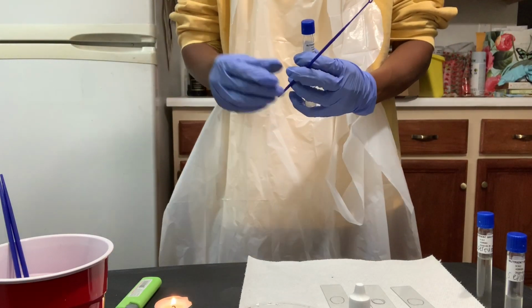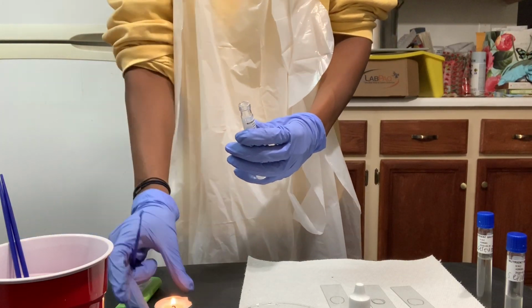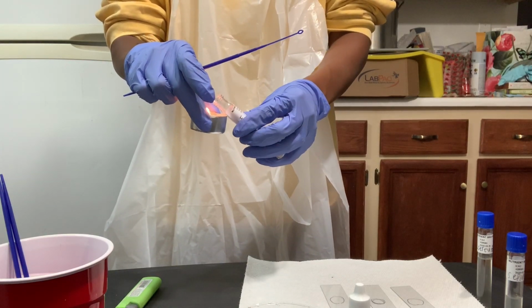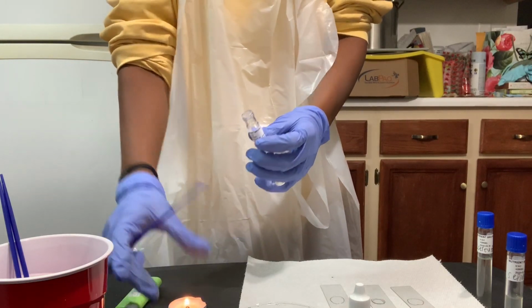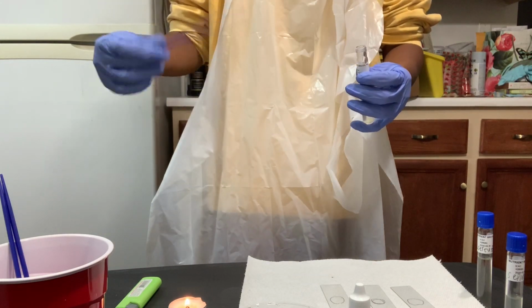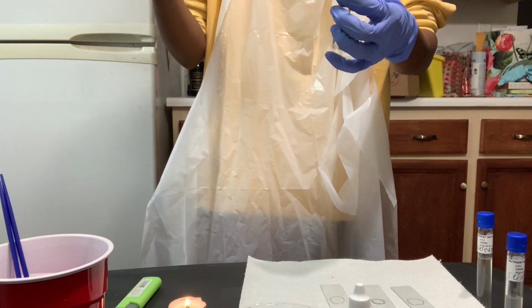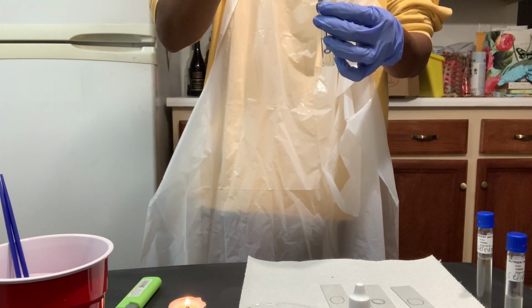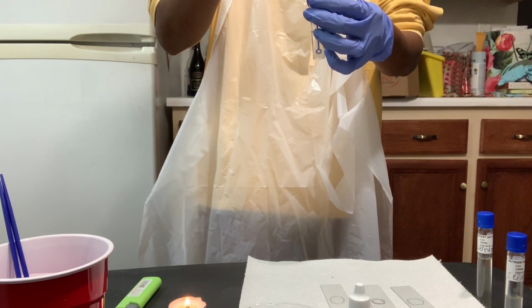Shake it dry, and then I am going to pass the lip of the E. coli through my flame for sterilization. We're going to make sure this loop is nice and dry, and being careful not to touch the rim, put the loop in our bacteria.